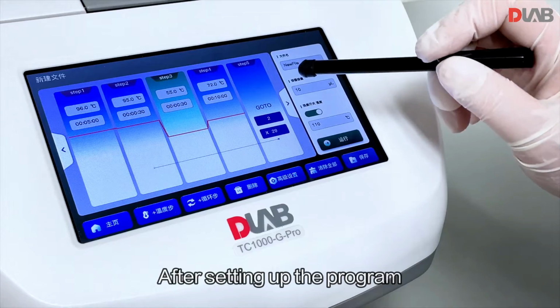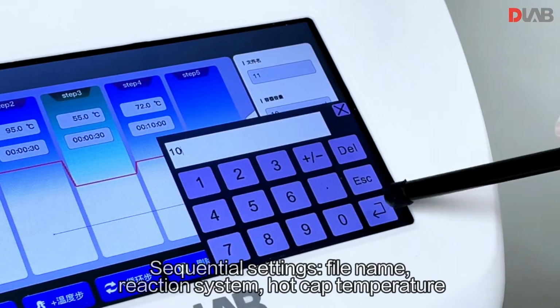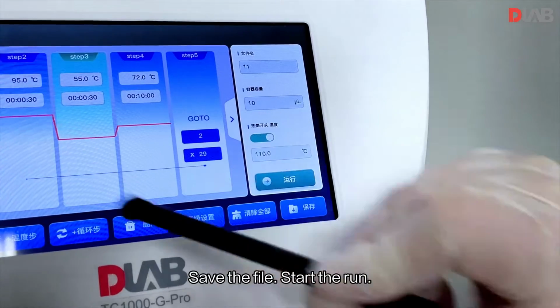After setting up the program, set the file name, reaction system, and hot cap temperature. In the default state the thermal cover is opened at 110 degrees Celsius. Save the file. Start the run.